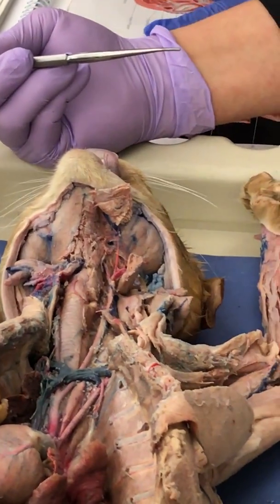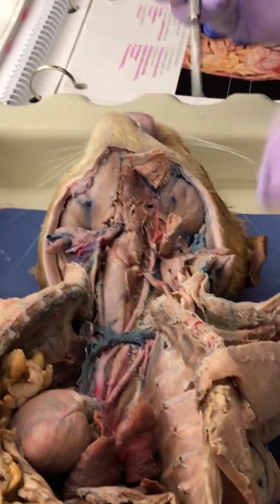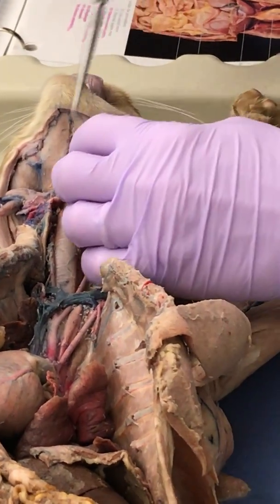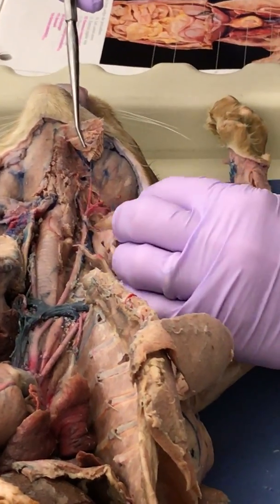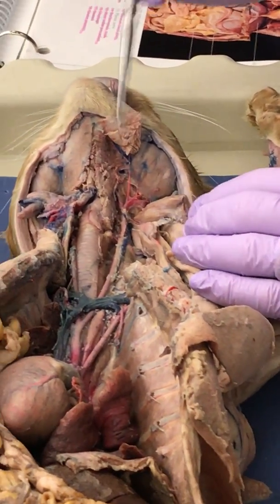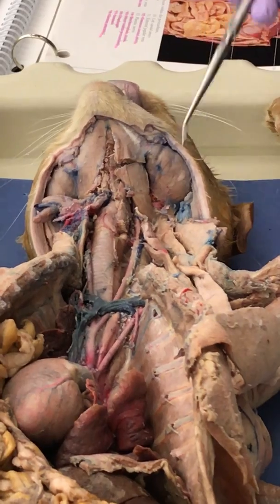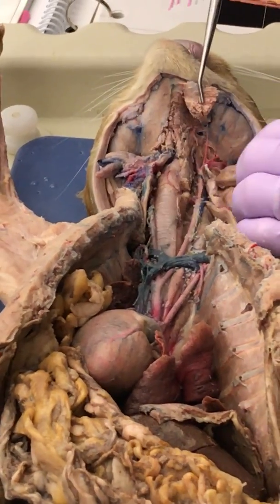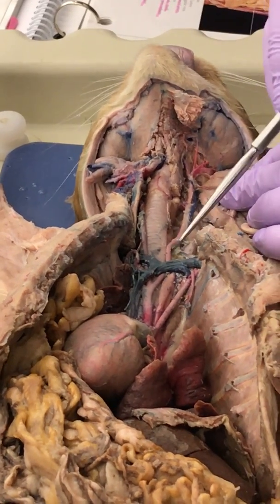I knew it was under the digastric, it was hiding it. See, look. See, that's digastric. So when we bisect it and then reflect it, you can find stuff. Okay. So when you put digastric back down, you don't see much of anything, really. Okay, so that was up the carotid.